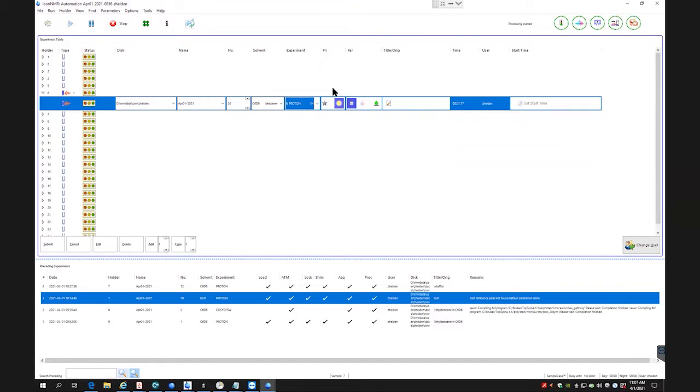The next option is priority. It's automatically set so that it'll run the experiment as soon as possible, so you don't need to play with that at all. You have the option of day or night queue. Everything's really set up just to run off a day queue where they run automatically after each other. We didn't quite set up a night queue because we don't have the demand to set that up right now. So you can just leave that set as day.